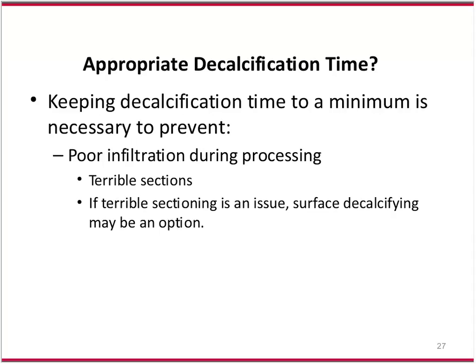But it doesn't save them money if we get to the end and they have made their EDTA in their lab or got it from somebody else, went and bought it. That's okay. You can buy it, you can make it in your own lab, but you have to make sure that the pH and the way that it was pH'd, with what chemical, are the same way that we do. Otherwise, when we go to cut these samples, we find that we're cutting into something that is just horrible. And it scratches, and there's still a whole bunch of mineral left in the sample.